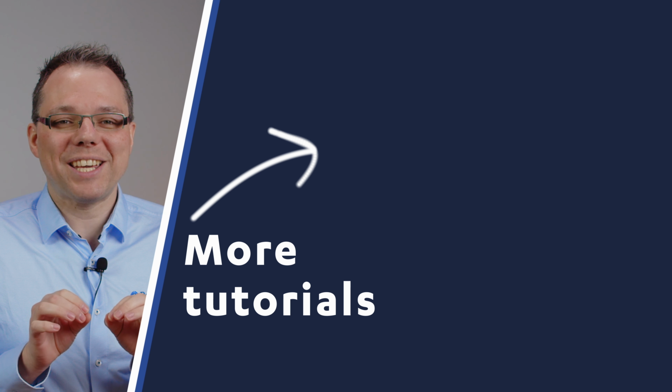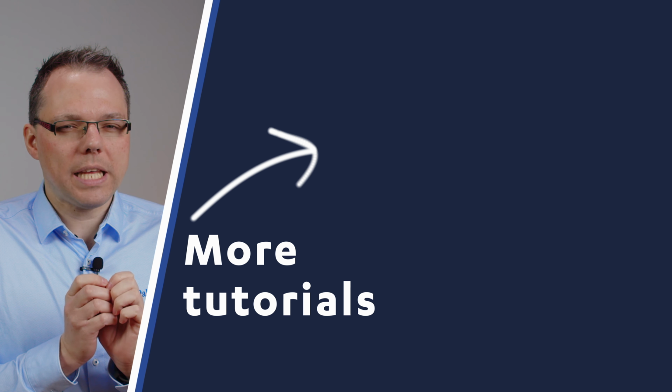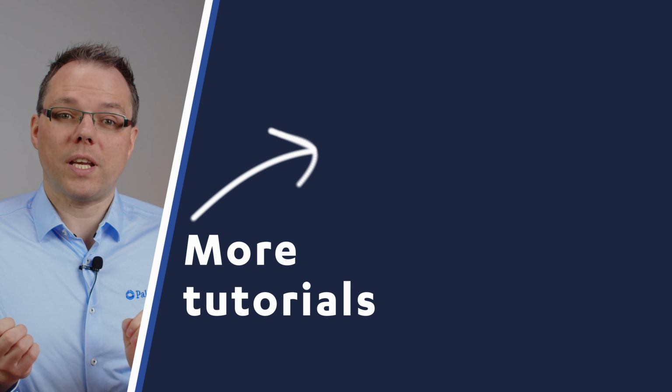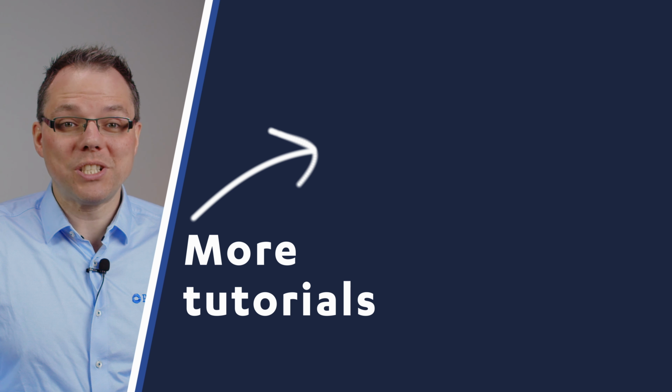Right, so that was everything I wanted to tell you about the simultaneous mode. In a future video we will explore the individual mode, where we can give different methods to different channels. And if you're wondering how do I get to the simultaneous and individual mode, maybe you should watch our previous video where we show you all the options from the starting window of Multitrace.